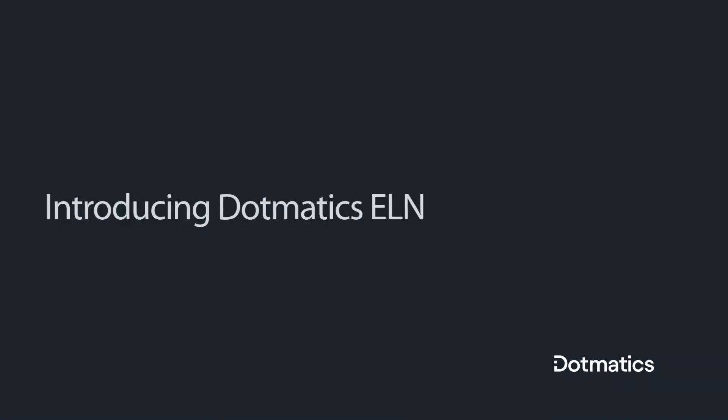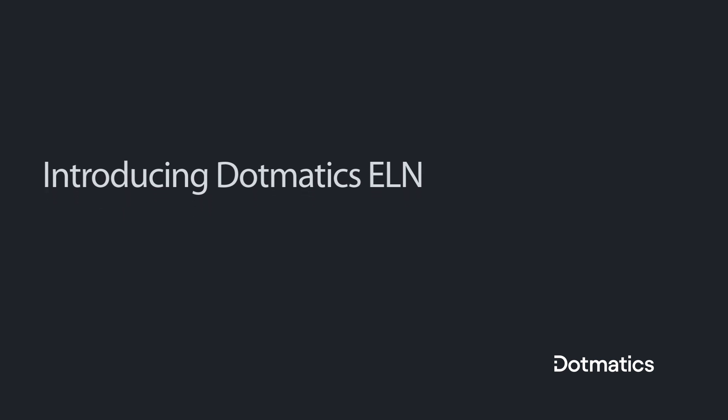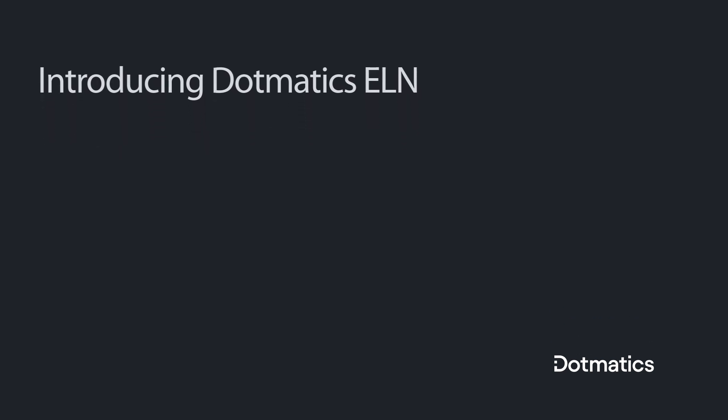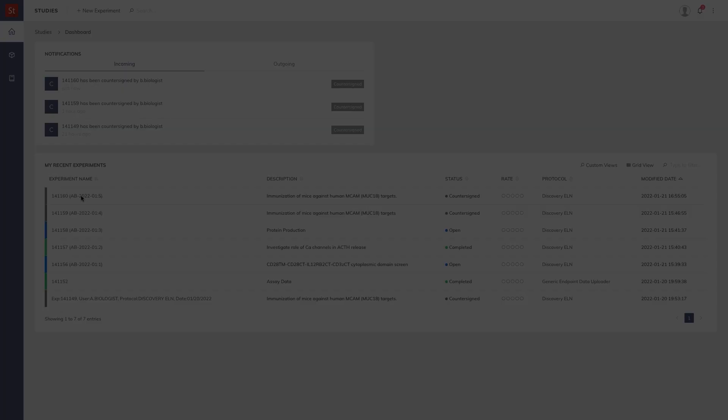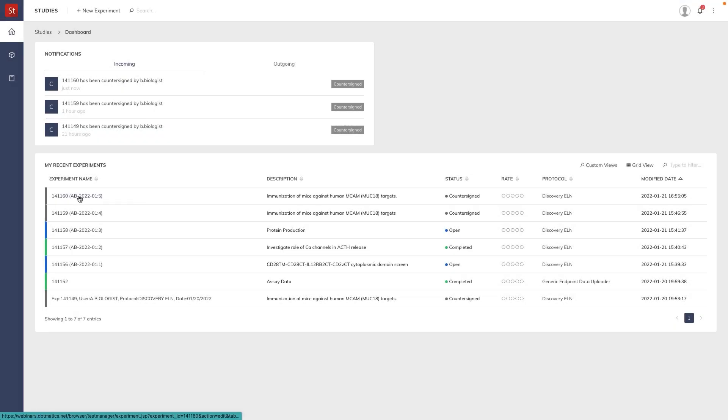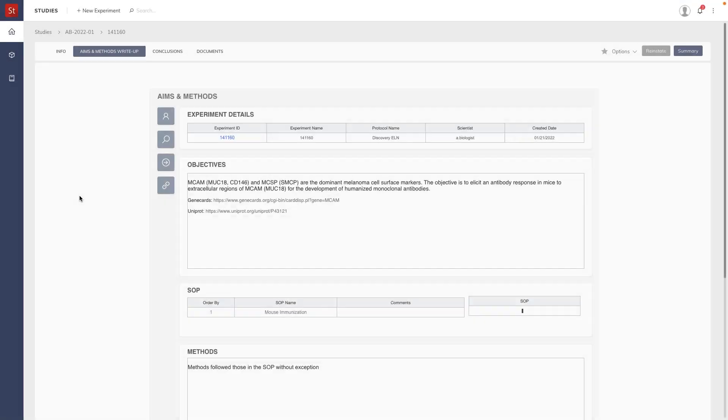In this video we'll take a look in more detail at the documents section. This is a very flexible section that allows us to add a variety of data. Since we closed our last experiment, let's clone it to create a new experiment.